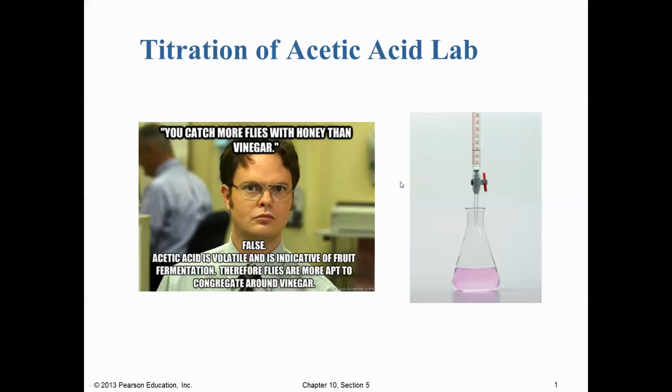Hello everyone, and welcome to the titration of acetic acid lab video. This is a relatively straightforward experiment that's designed to give you practice titrating. And so this week I want you to work slowly and carefully.